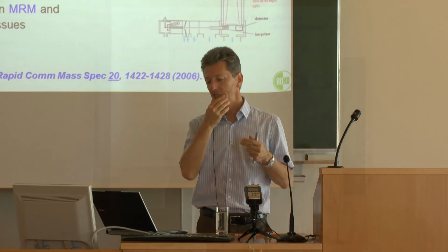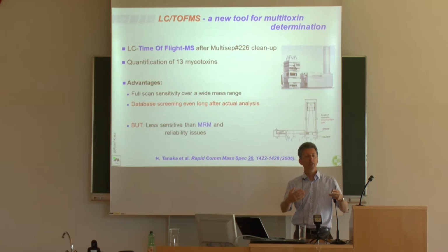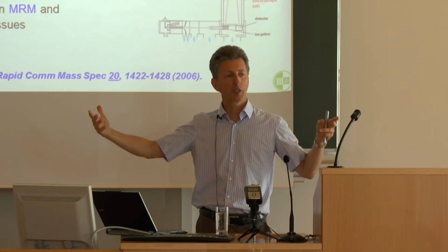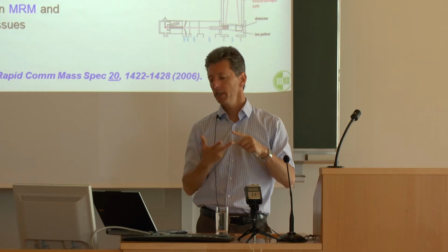Why? Because in LC tandem mass spectrometry, one has to select the analytes before you perform the analysis. Here, you can select the analyte even 10 years after you have performed the analysis, because you do a full screen of all the masses which are there and don't select them beforehand. The problem is that you need a large storage place to store this large volume of data. It takes longer. It's not as sensitive.